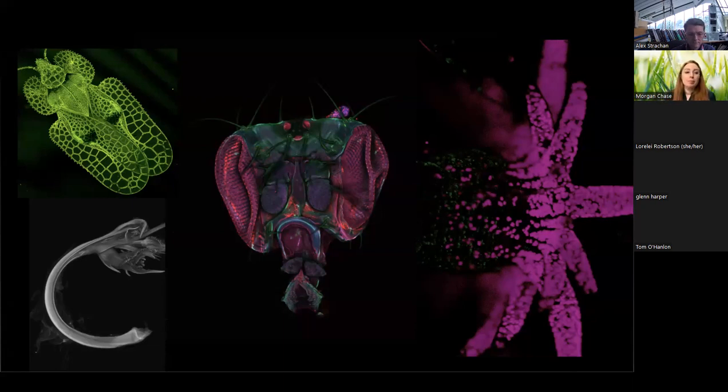So famously, rocks fluoresce, but also insects and other biological creatures. So on the right is an anemone. That was an interesting project to do because they tried to sedate it essentially with some sort of anesthetic, and it just continued to move. And so there's a video somewhere of that. I'd have to try and find it from the student. And then in the middle is I think a fruit fly.